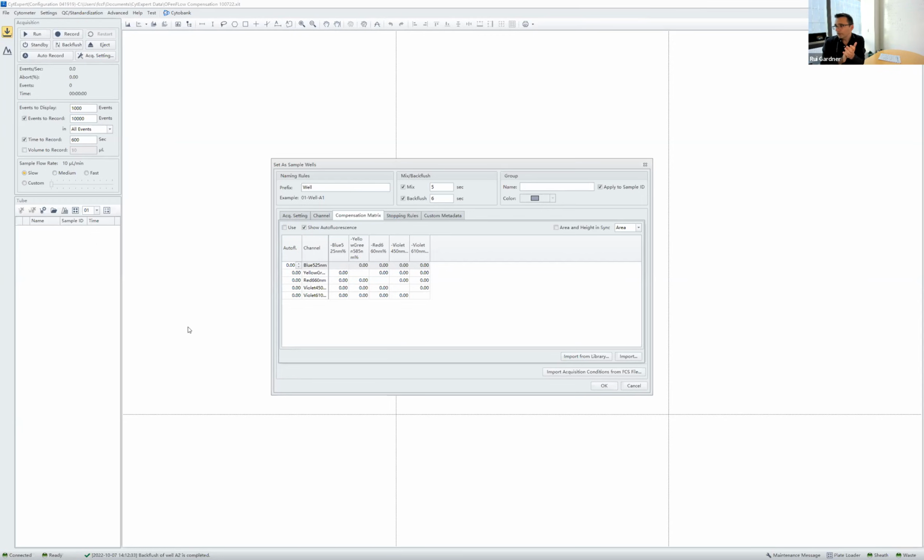The important thing is that even when the instrument is well set up and performing well, even if the reagents are supposedly working well, if you're using beads versus cells, you may encounter some differences in the spectral properties of each fluorochrome. The fluorochrome won't be exactly the same in the bead as it is in the cell, or vice versa, right? So that's the first thing.